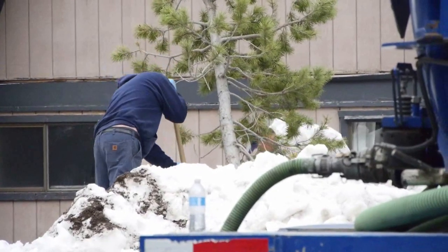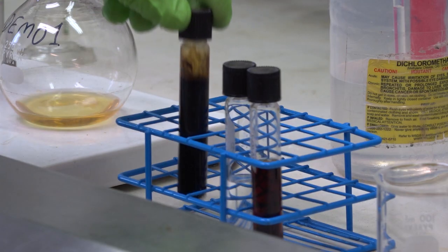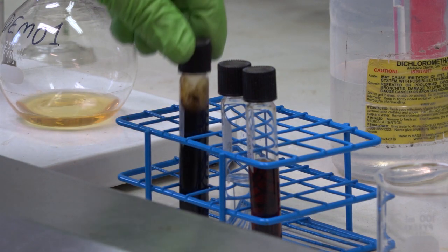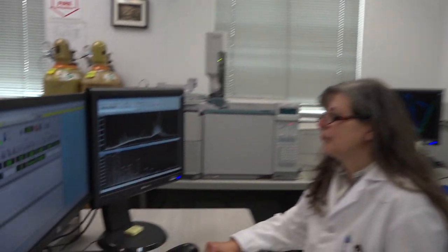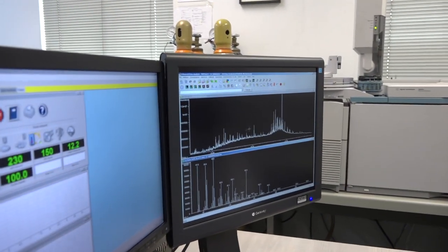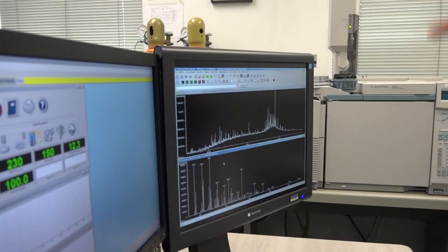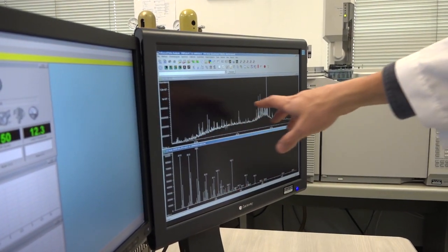Part of the officer's investigation includes gathering samples of spilled oil, which are transported to the lab for analysis. The fingerprint you'd see over here on the right screen. Joe Lacalle and Carosella Gadbury, the two other staff chemists, compare fingerprints on the computer.